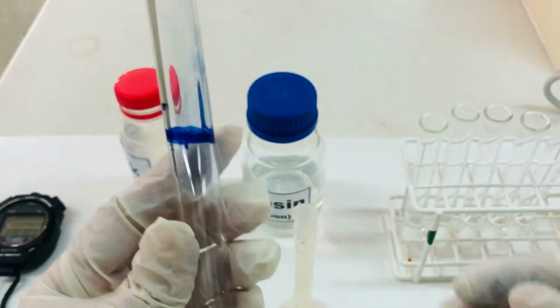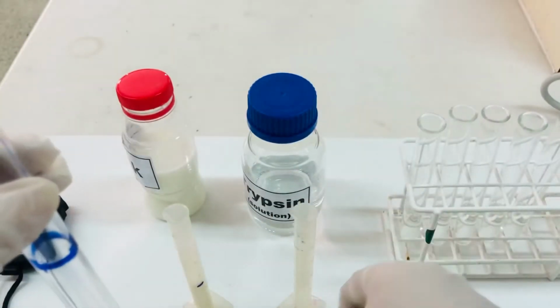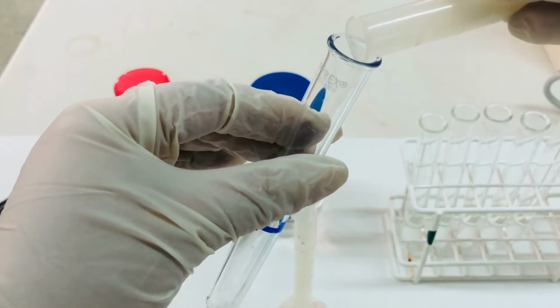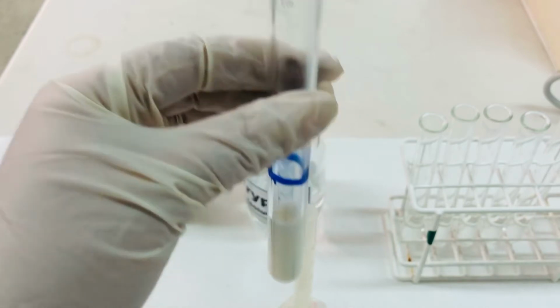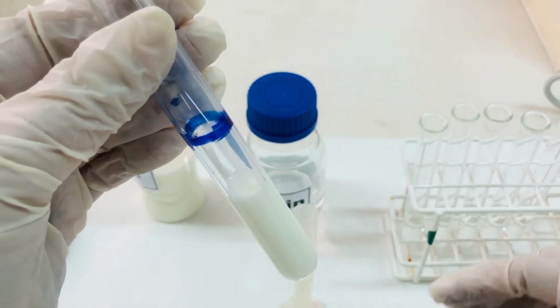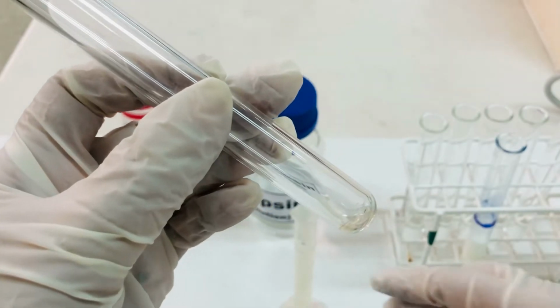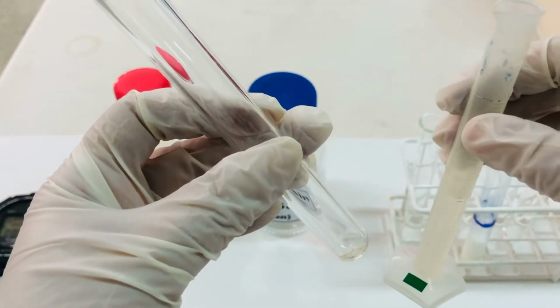So, first I have taken this marked test tube and I am going to pour 5 ml of milk sample to it. As you can see, the milk sample has been poured in the test tube, and now we will take another test tube and fill it with 5 ml of trypsin.